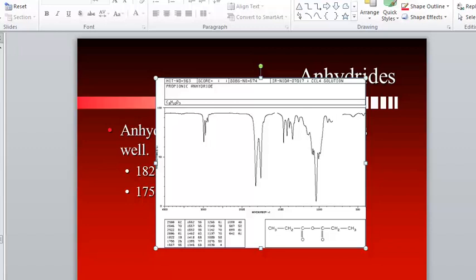And then a little bit above 18, we see that peak about the same distance down, and that is the presence of another carbonyl that's separated by an oxygen, otherwise known as an anhydride. That is why we see two signals here, right?